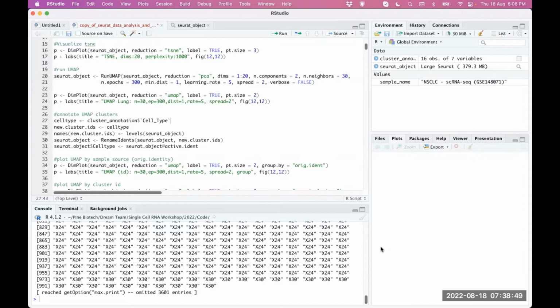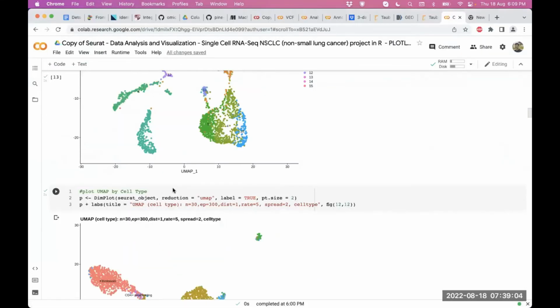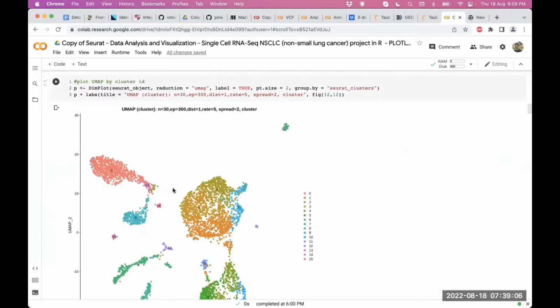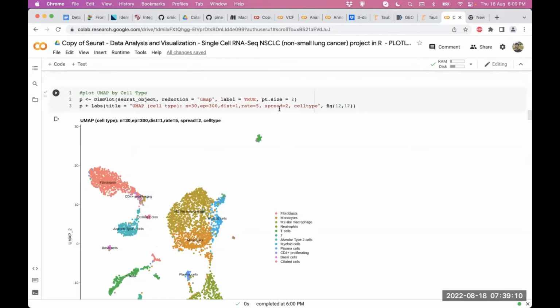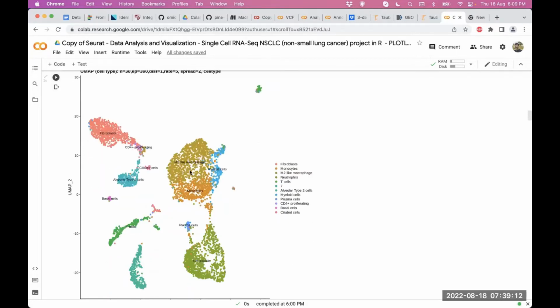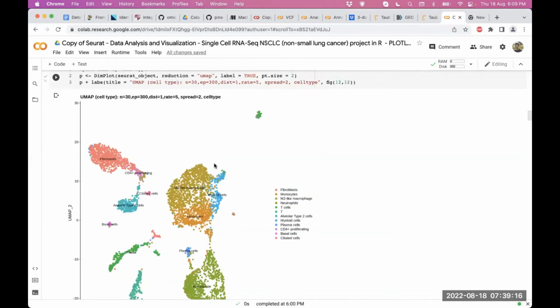So there are specific advantages in using a Colab-like setup, and people are actually using Colab-like setups on local computers also, like Jupyter Notebook and so on. And that will help you in analysis like this. You can compare and contrast the output, right one below the other, and check what specific code makes this type of plot, so that you can come back to the code and relate.